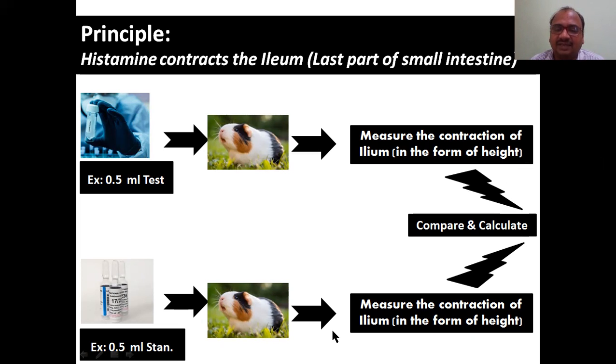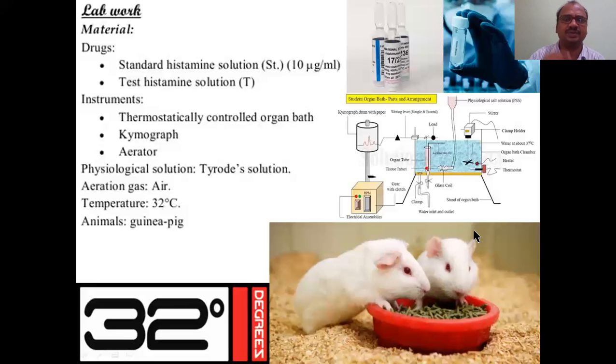Measure it for the standard preparation and for the test preparation also. You have to compare both and calculate, and finally find the amount of the test preparation. That is the main thing you have to do. This is the lab work.